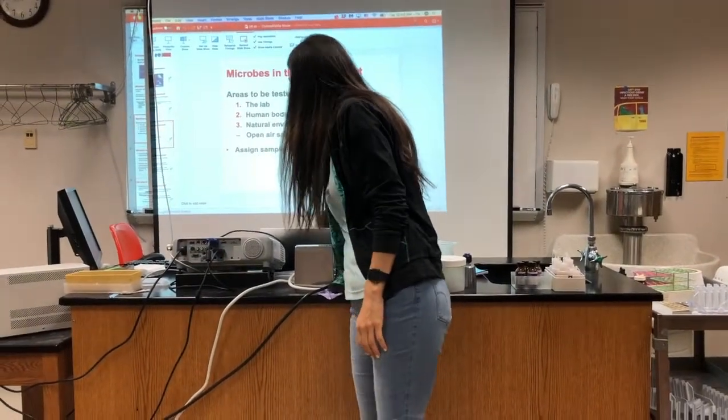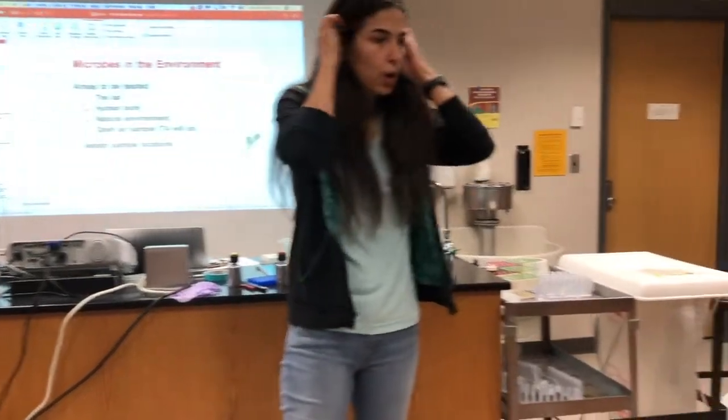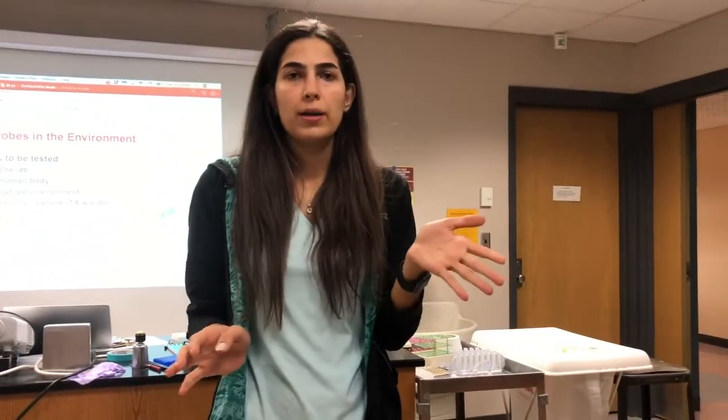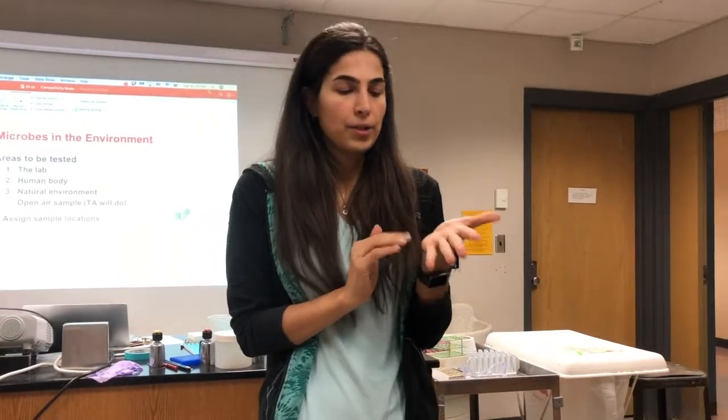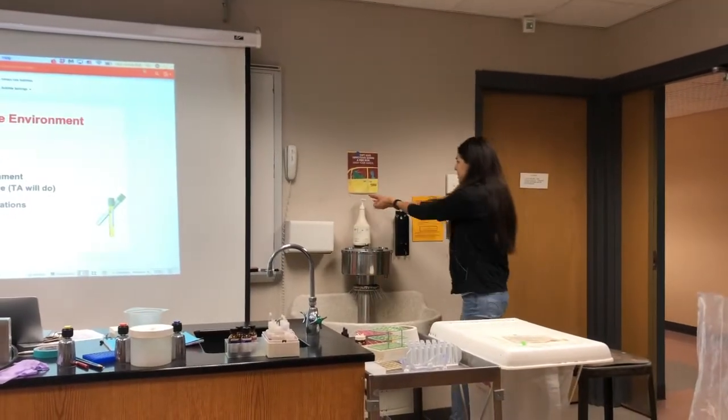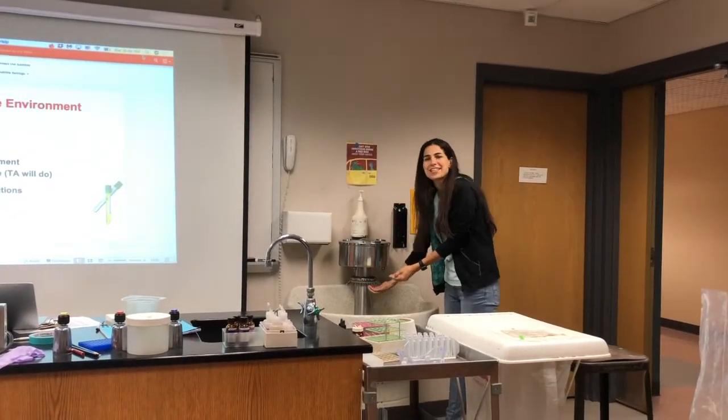The next sample is the human body. I will grab samples from my hands. But first I'm going to wash my hands. I will wash my hands for 30 seconds.